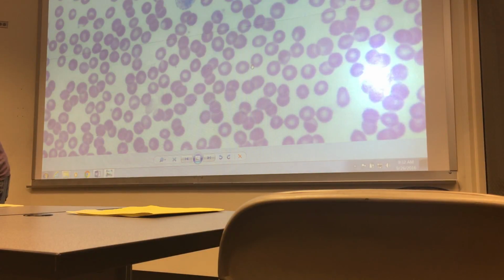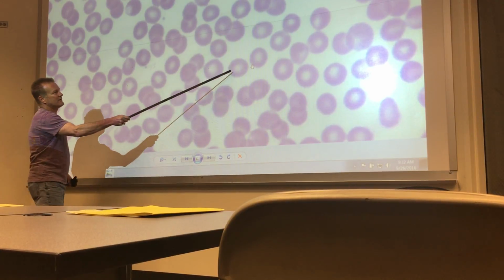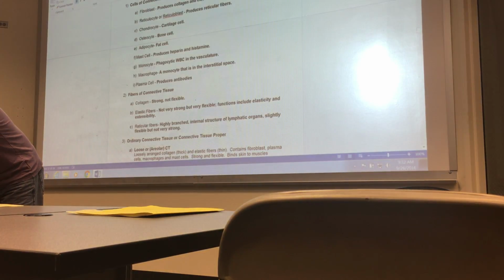Do realize, because it's interesting, I suppose, red blood cells are anucleated. They don't have a nucleus. Sometimes we think we see the nucleus in red blood cells. No, they're just thin spots. They're just thin spots. Perfect, exactly. They are just thin spots.